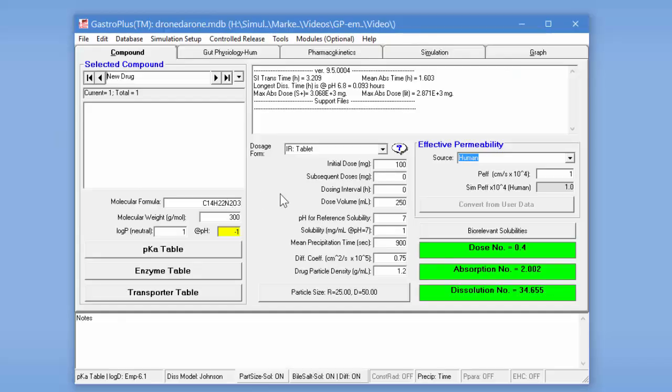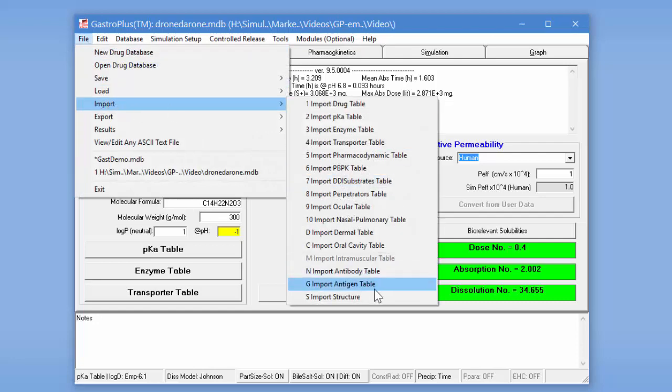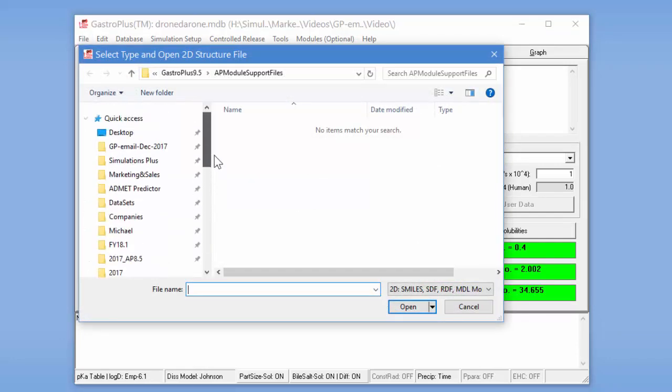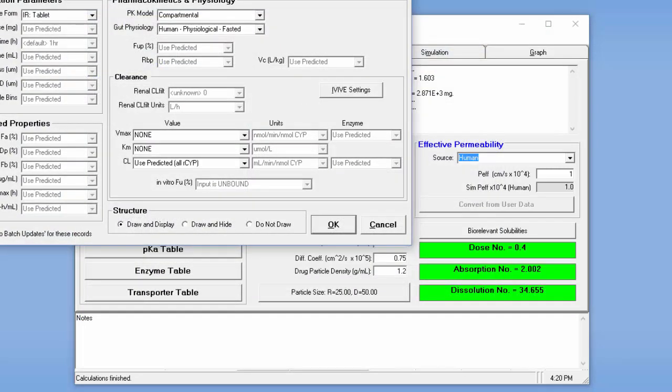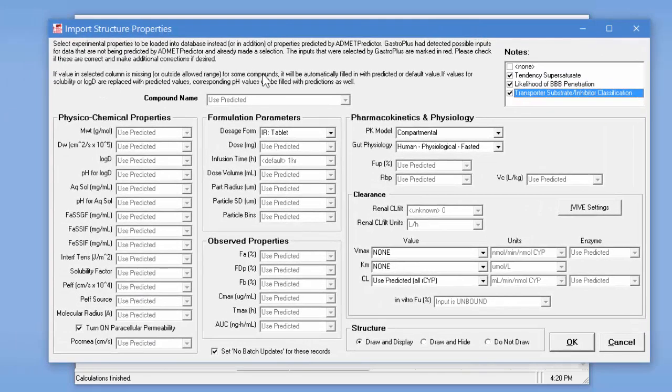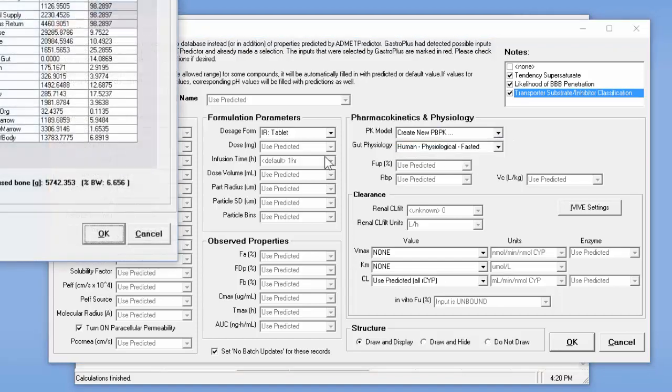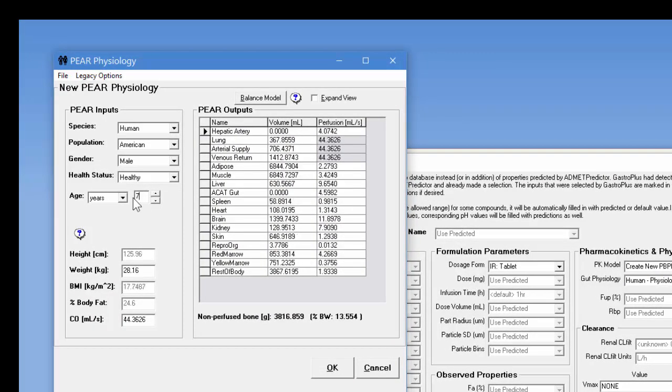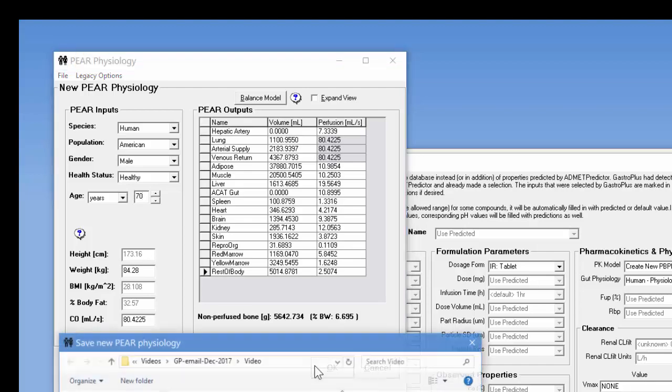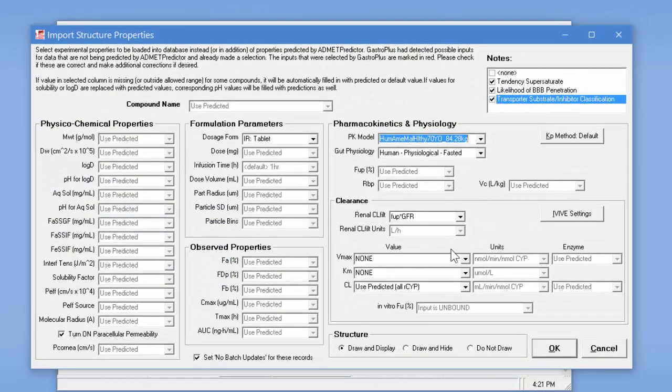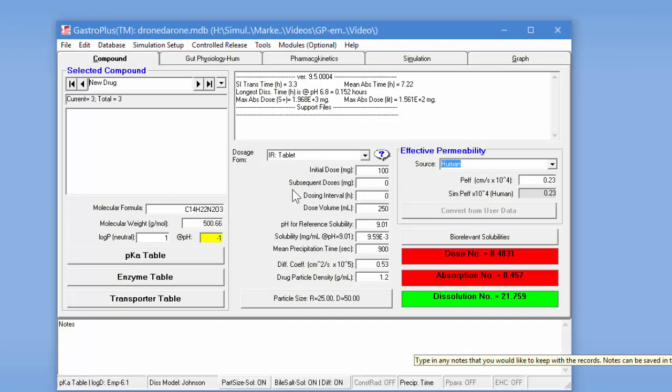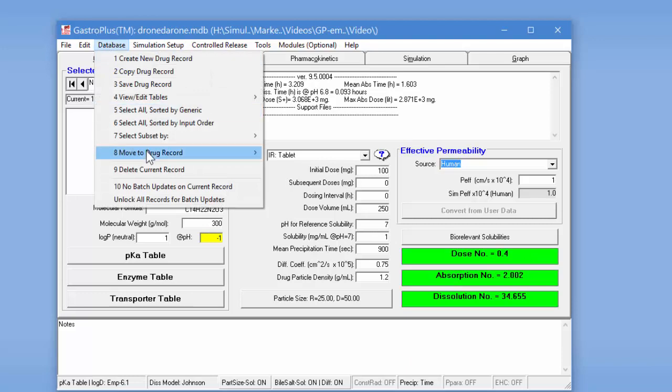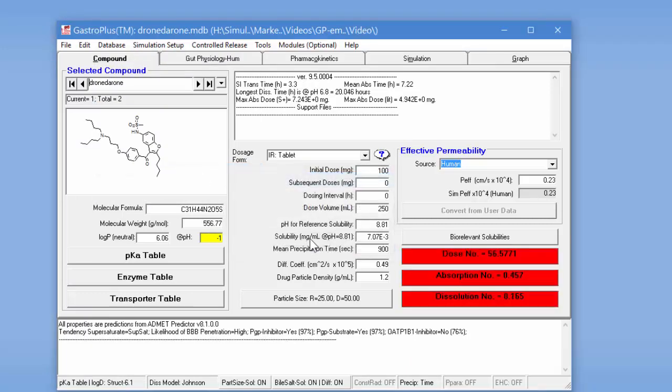I've created a new database and I'm just going to import the structure of the parent and metabolite into that database. So it brings up the import structures dialog box and I'm going to set up a PBPK model of a 70 year old American male. And then I'm going to use the Vmax and KM values for recombinant CYPs and I'll just click OK and it imports those two records.